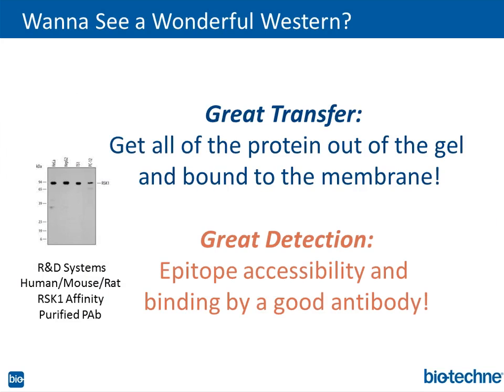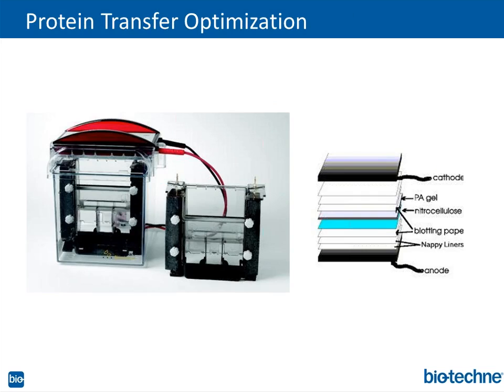The overall message is what? We need to have really great transfer. We've got to get all that protein out of the gel and onto that membrane. And once it's out of the gel and onto that membrane, we then have to optimize our detection, and that's really what it's all about. So let's get right into protein transfer optimization.